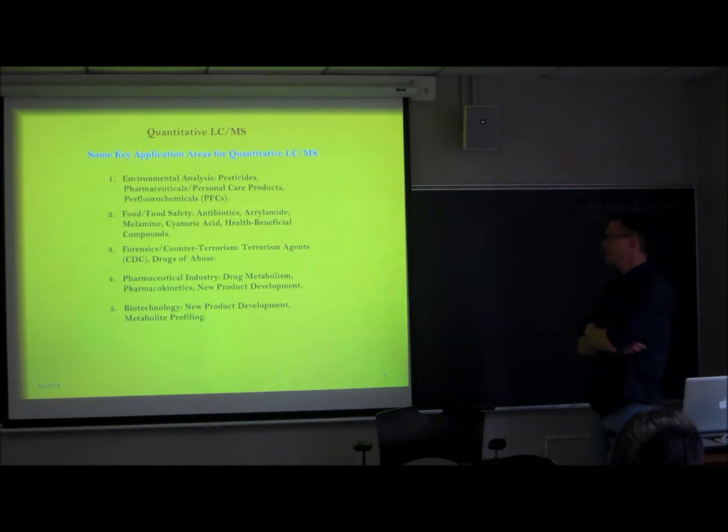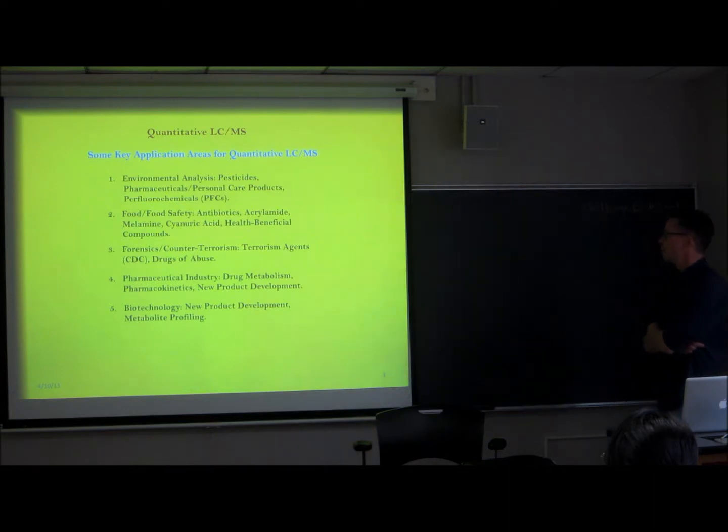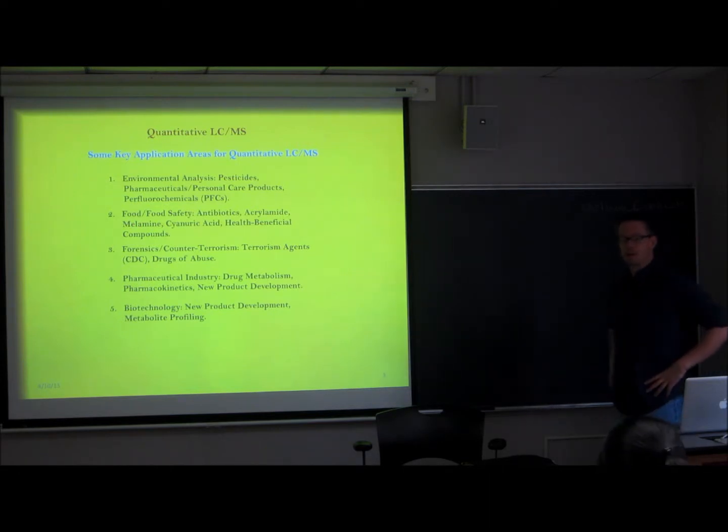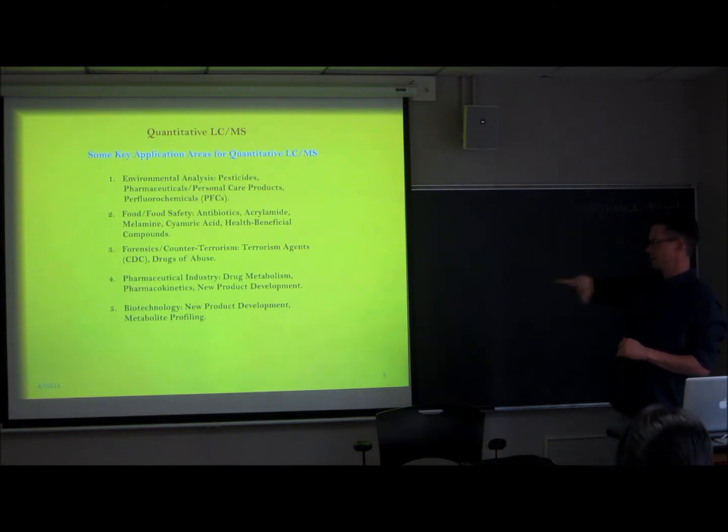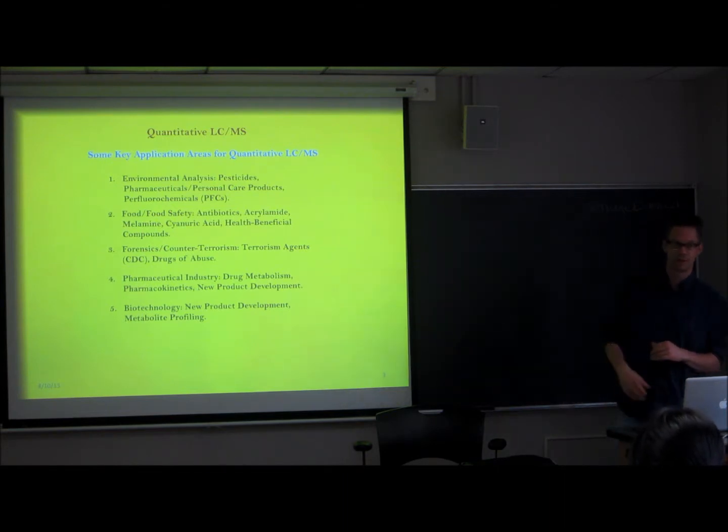Food and food safety, which is becoming a real forefront scientific endeavor in industry. Antibiotics, acrylamide, melamine, cyanuric acid, or health beneficial compounds in food. LCMS is going to be a technology that's used very often in that field, primarily because there's just nothing more complex than a food matrix.